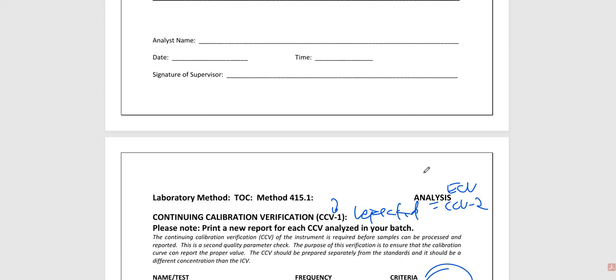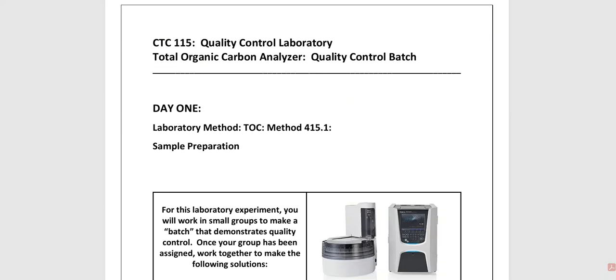A lot of people, if they graduate with a bachelor's degree, a master's degree, a PhD maybe, even some of the other associate's programs, have never been exposed to the concept of what a batch of samples is all about. They have no clue that all of these self-check measures have to be in place before we can release data.